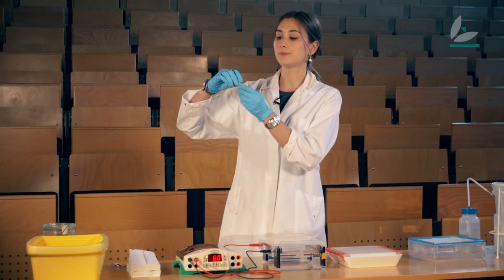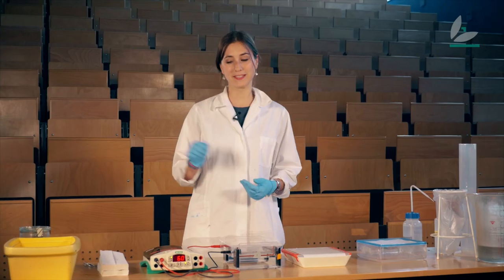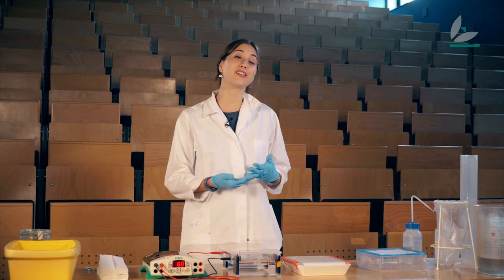I have the sample where I've isolated the RNAs of a plant piece. And I want to find out if the RNA of my gene of interest is in there, to find out if my gene is active.